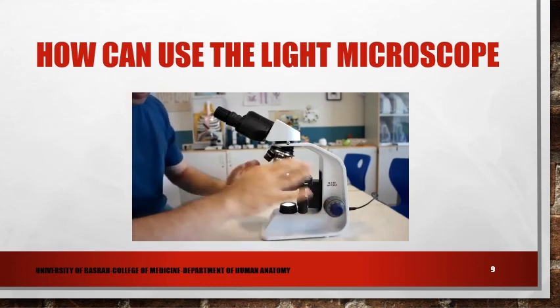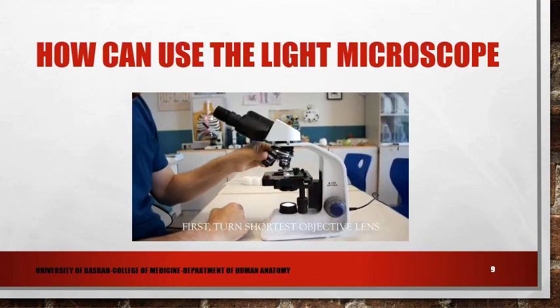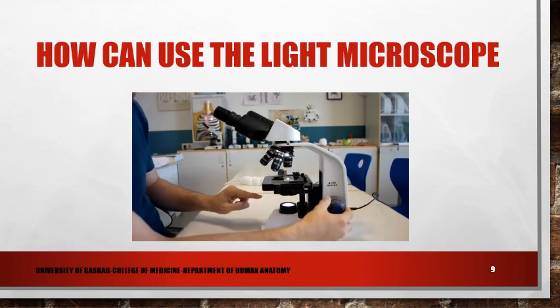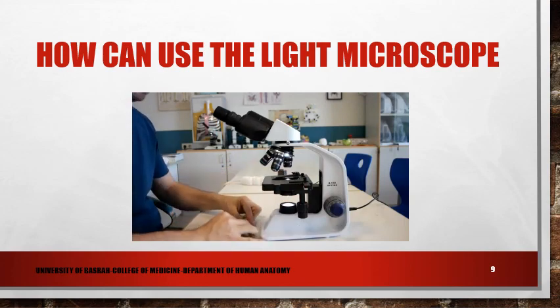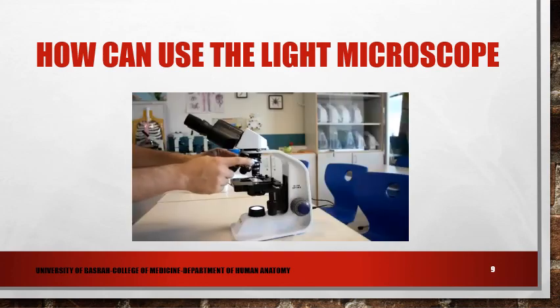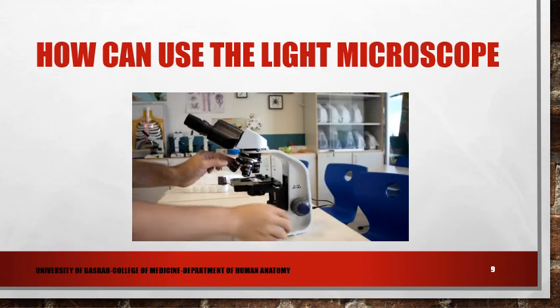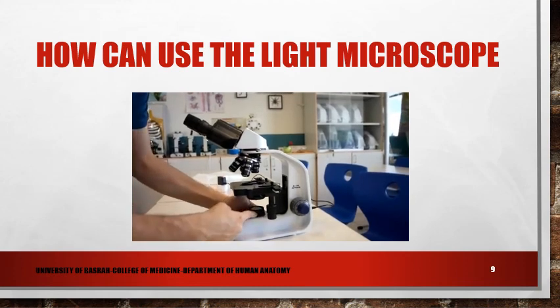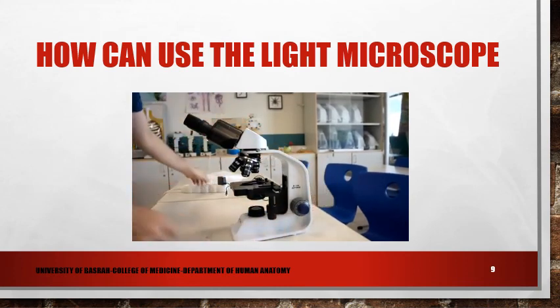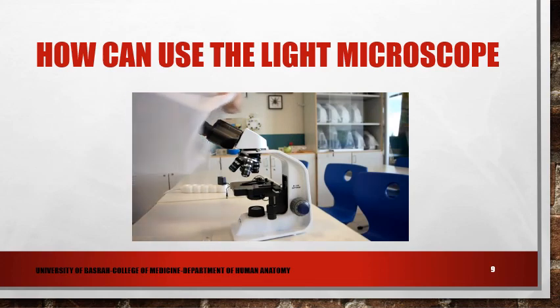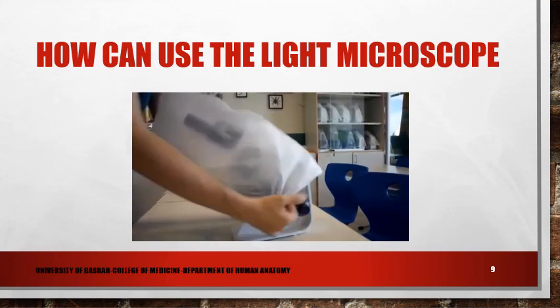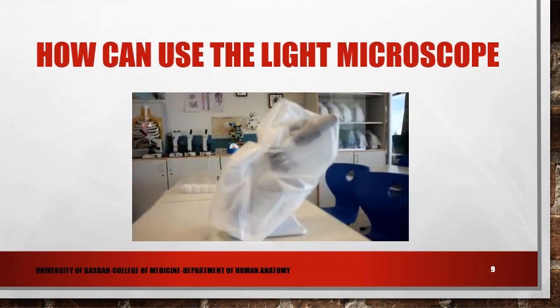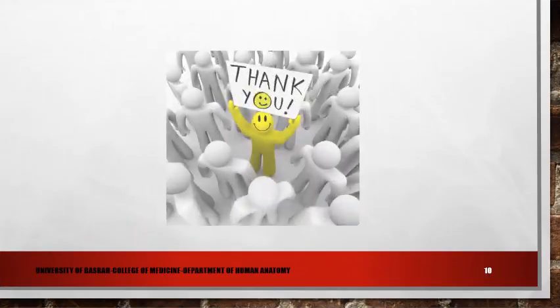When you're done, before touching anything else, make sure to turn back to the shortest one. Then by using the coarse adjustment knob, make sure the stage is down. Take the slide out. This is how we use the compound light microscope.